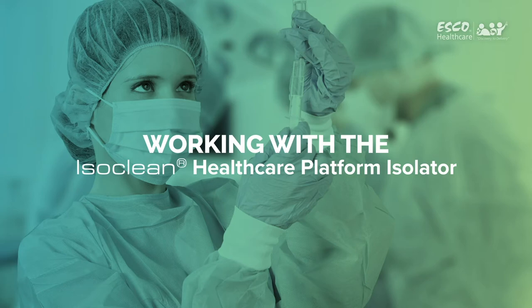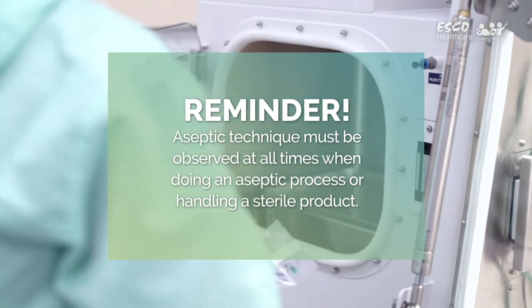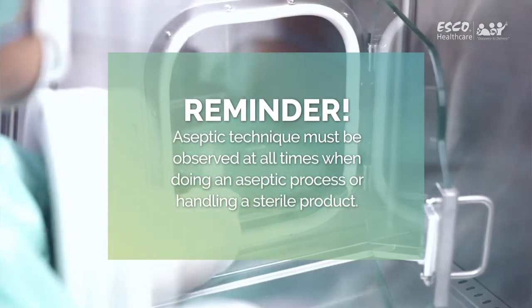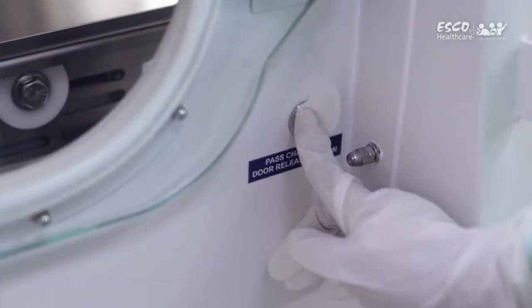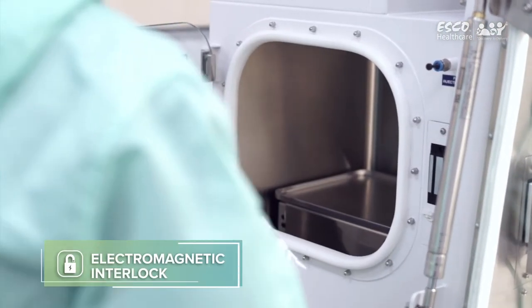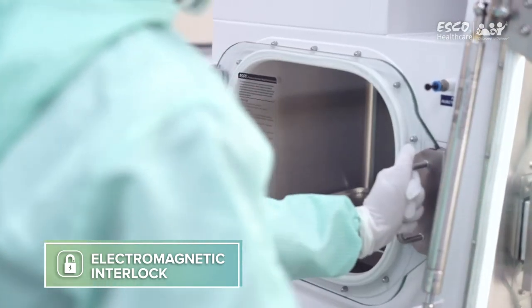Working with the IsoClean Healthcare Platform Isolator: If you are doing an aseptic process or handling a sterile product, please observe aseptic technique at all points of the process. If the isolator is designed with two pass-through chambers, designate one PTC for ingress of raw materials and the other for egress of finished products. Open the pass-through chamber designated for ingress by pressing the outer door button. Since the HPI is designed with electromagnetic interlock, you must wait for a designated period before you can open the inner door to bring in the materials needed for the process.